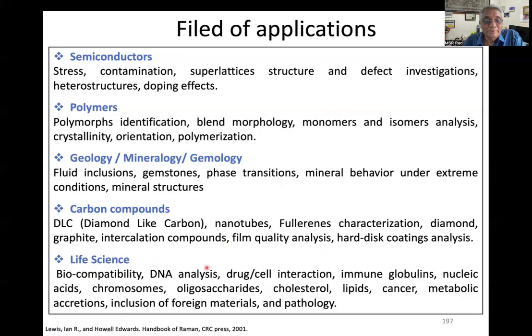Life sciences, talk about biocompatibility, DNA analysis, to detect drug cell interactions, cholesterol, lipids, cancer, all this process also are heavily reliant on Raman spectroscopy.